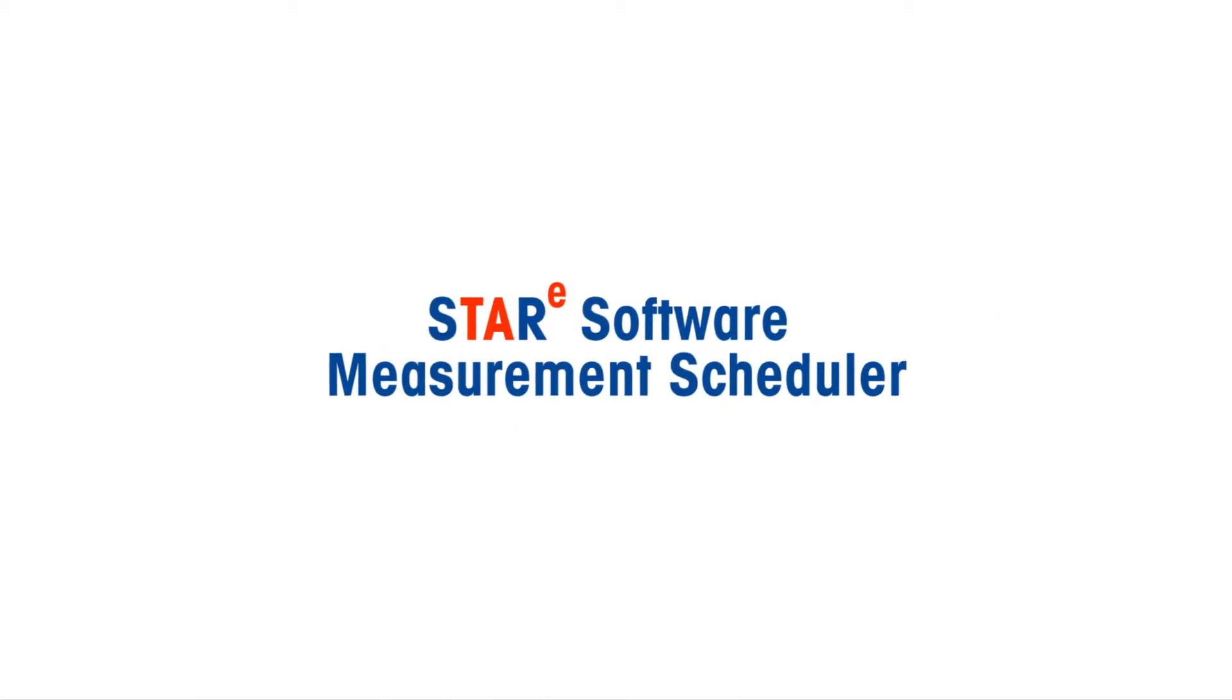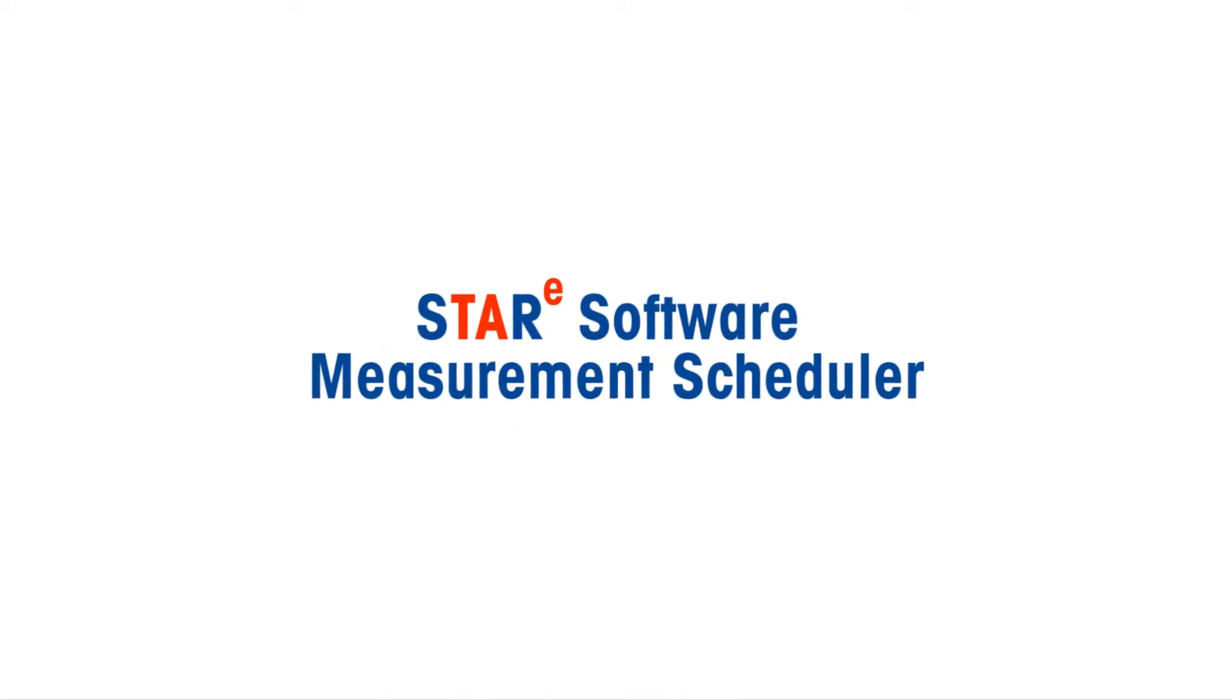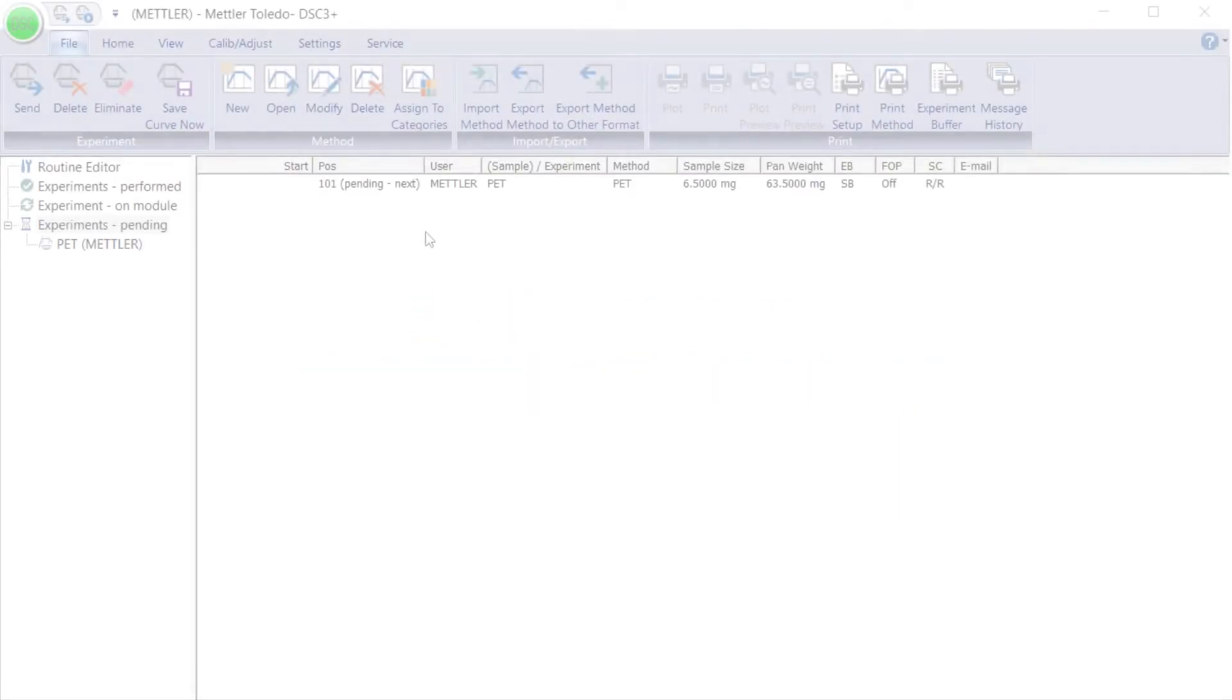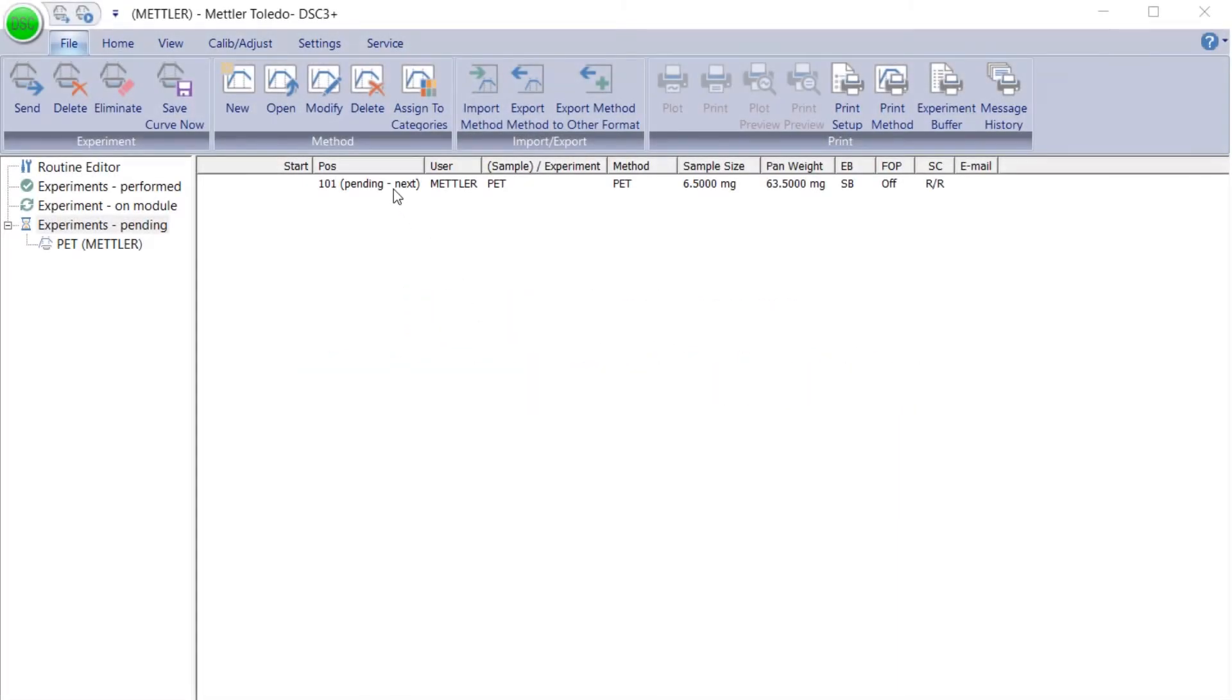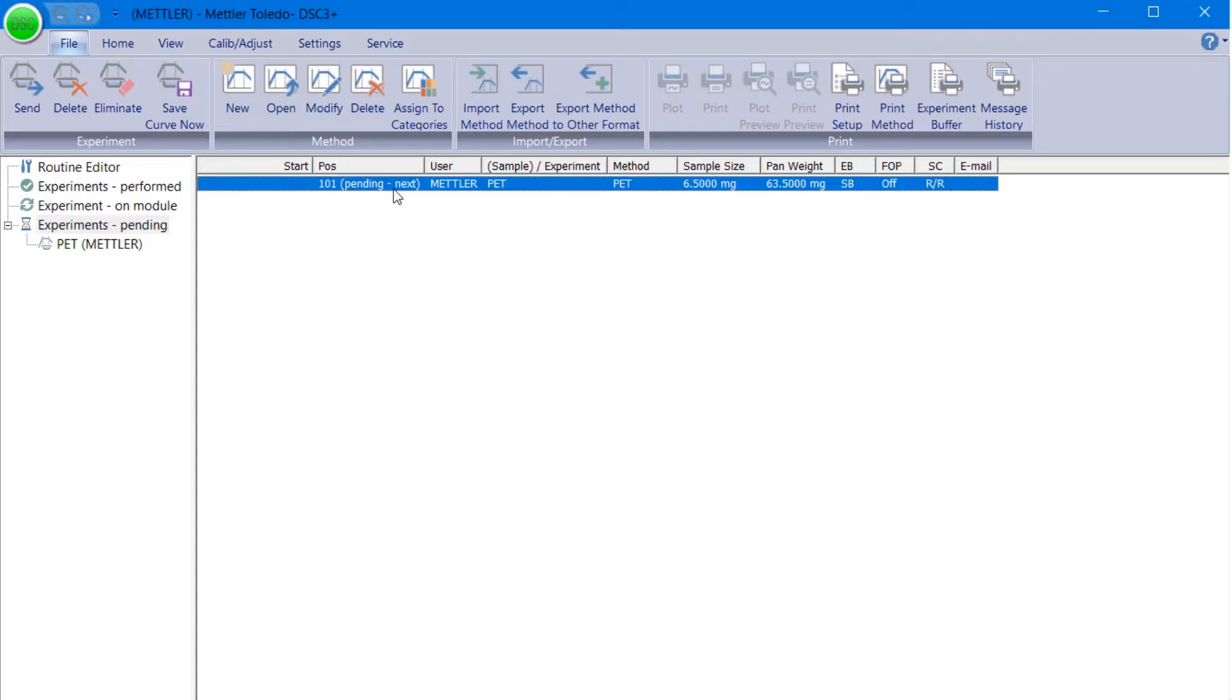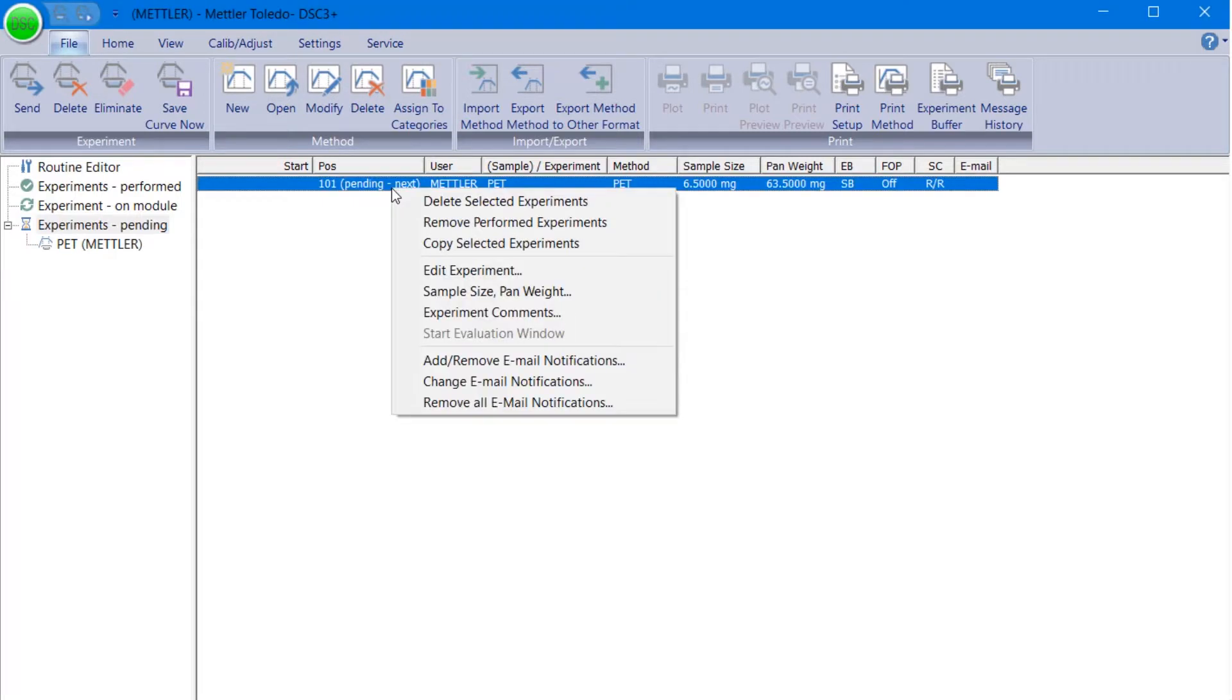We will now show you how to schedule the start time of an experiment. Go to the Module Control window in the STAR-E software and select the desired experiment from the experiment buffer by right-clicking on it.